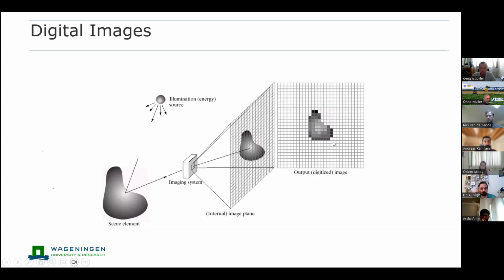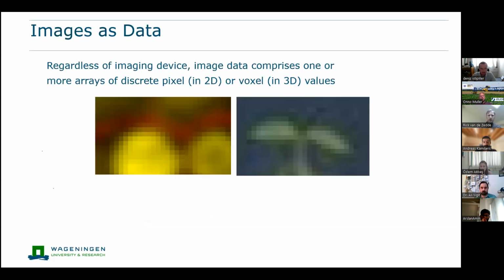And then algorithms need to make sense of this collection of numbers. So this, in this case, grayscale, so slightly higher values here, slightly lower values here, and 0 values over there, with maybe even some noise. To illustrate this further, so this is the imaging part, right? So if you have a random image, like also again from your mobile phone or from some kind of imaging system, and you zoom in a lot, then this is actually what the algorithms are working on.